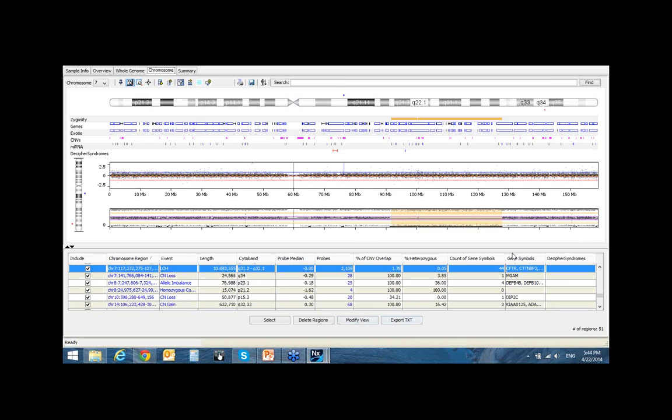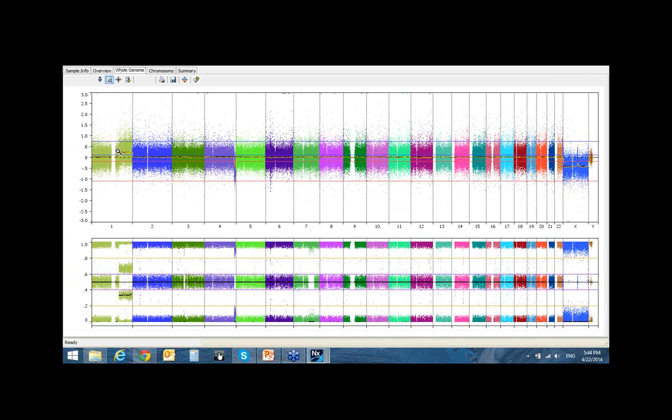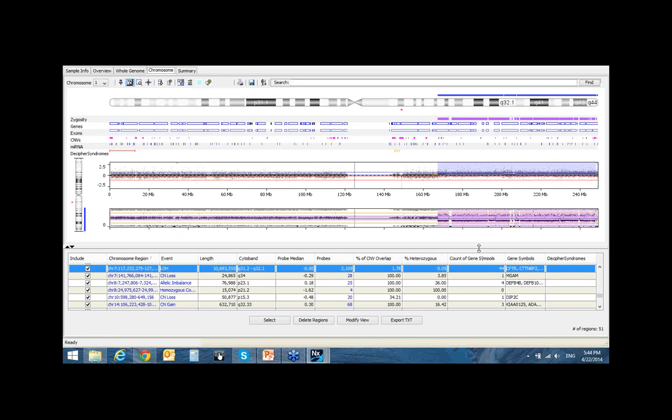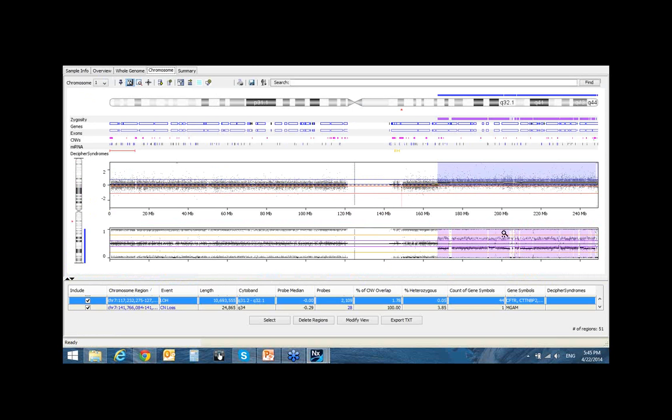So to answer your question, basically we have those 4 different colors. As I said, the purple is based on the copy number gain region. Like here, we have a copy number gain on chromosome 1. You get a 4-band pattern. Then we get the purple color right there. So if it's yellow, that's copy number neutral.